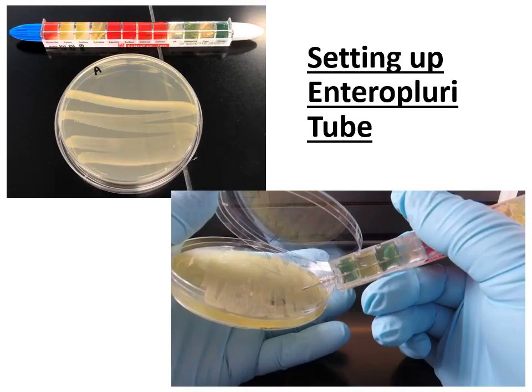So now we're just going to go over some of the protocol information. If you're working with an Enteropluri tube, you start out with the capped tube and you have a plate of unknown bacteria swabbed on there, so lots of culture. What you do is you clamshell open the tube, and when you uncap your Enteropluri tube, you see that there's a metal inoculation needle running through the whole tube. So you scoop up some of the bacteria onto the tip of the needle and pull that needle through all of the sections.